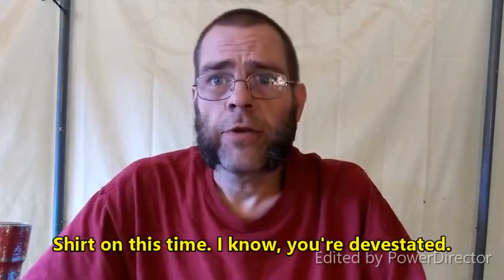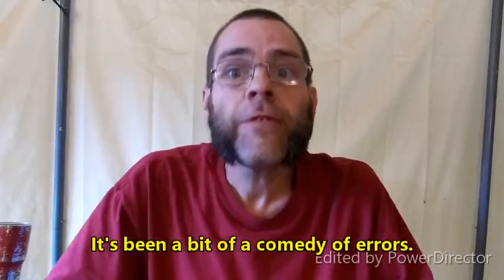In this video, I'm going to be showing you the synthesis of anthranilic acid. And I'm doing the slightly unusual step of sitting here talking to y'all face to face before you actually see this thing, because this experiment has actually been a bit of a nightmare. And it's not the only one. There were going to be two other syntheses that I was going to film before this one, and they were total clusterfucks too. So, yeah. Sometimes it doesn't always work well.